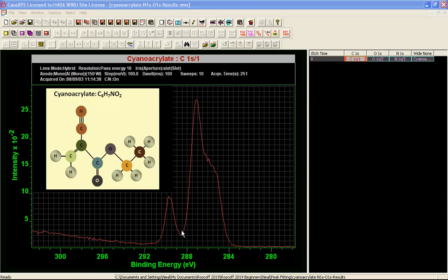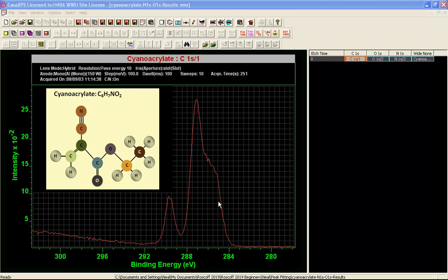A data envelope such as this one represents a highly correlated signal and to separate such signal into component peaks would be quite difficult unless you had additional information. It is extremely helpful here that we have an understanding of the underlying material that was used to create the sample that was then analyzed by XPS.